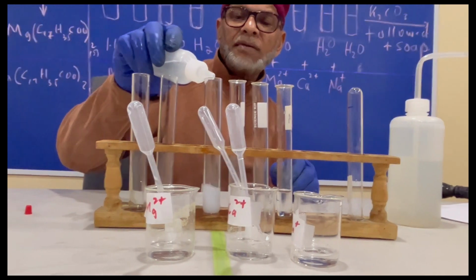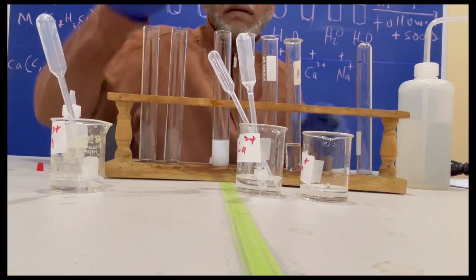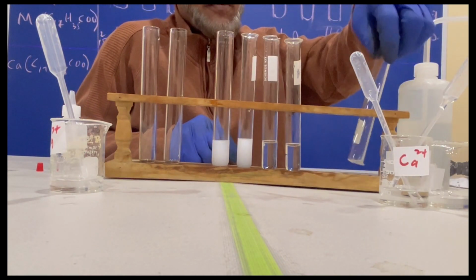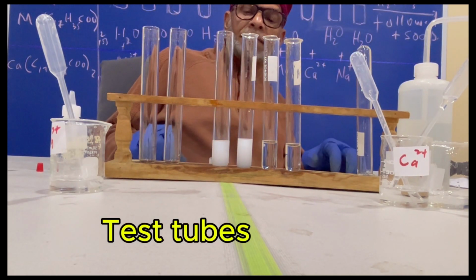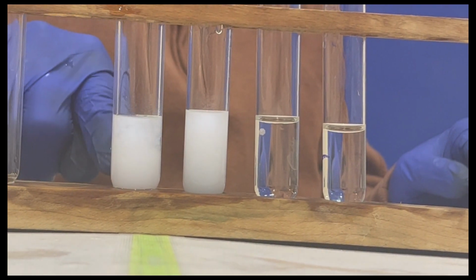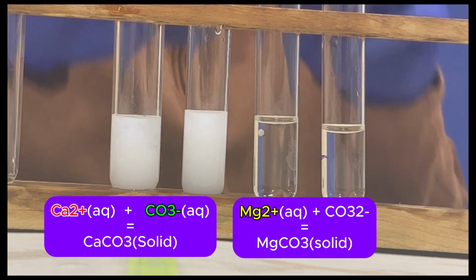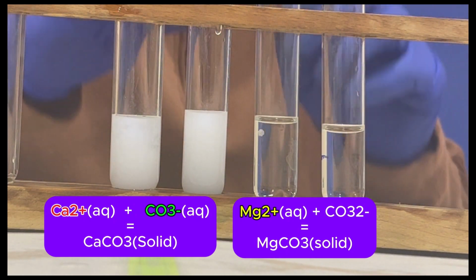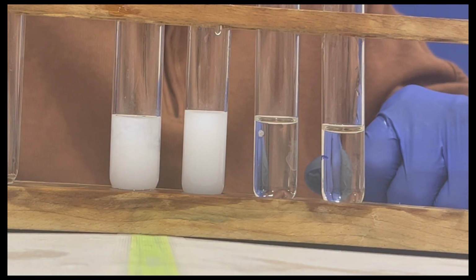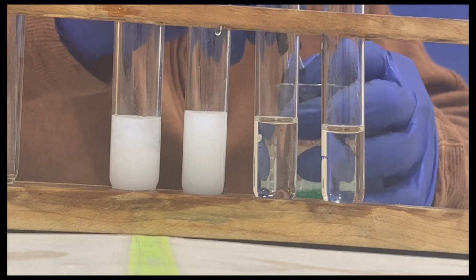Tap this one up a little bit more. Immediately you can see that a white precipitate is formed in the first and second case. These are precipitates of magnesium carbonate and calcium carbonate. Effectively, what has happened there is that we removed most of the magnesium and calcium ions and precipitated them out of solution. Now we'll see if that had any effect on the hardness of the water, or whether or not the water has been softened.